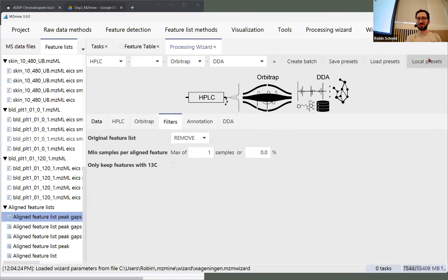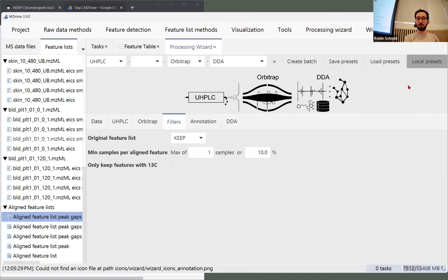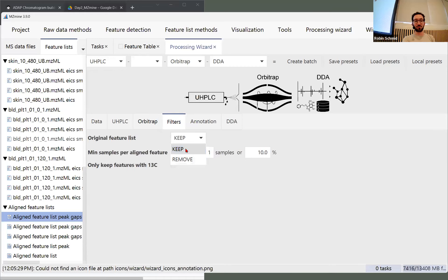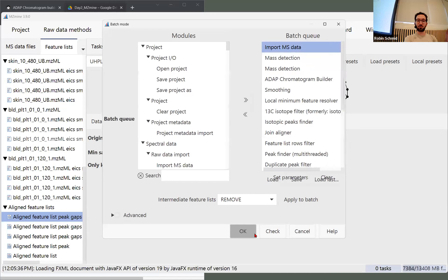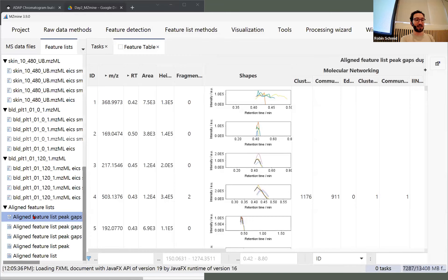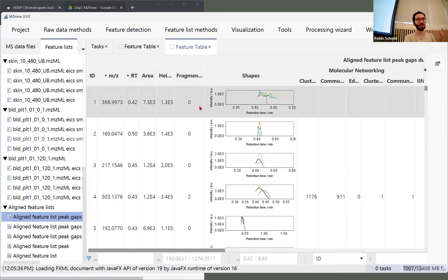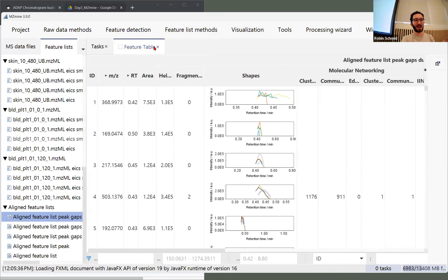A very fast way, now that we saved the preset, would be to go to the wizard, open those presets, and change it from remove to keep, create the batch and run it again — you'll get new lists being generated. But you can follow along: just double-click on the aligned feature list and it opens up a feature list tab.